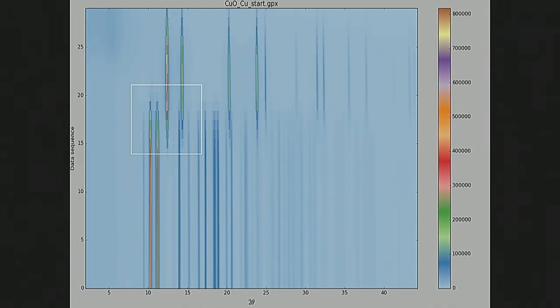We did atomic displacements, thermal parameters. We accounted for things like microstrain and crystallite size. So 4 or so, plus a couple that I'm sure we're forgetting. The actual number, it sounds like more than 6. Like thermal displacements could be in the list. Right, 3 for each atom and everything.